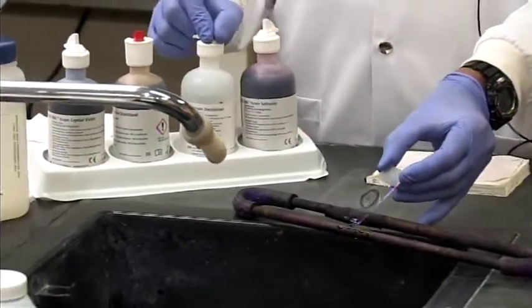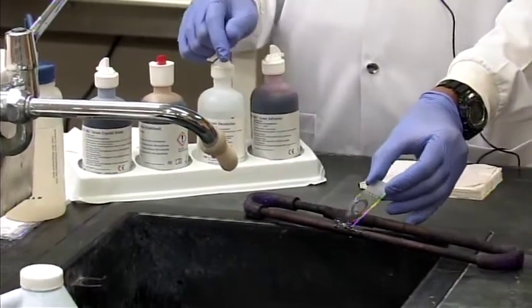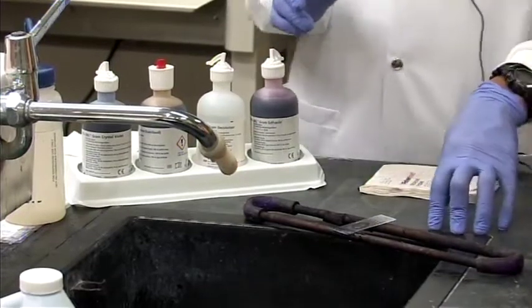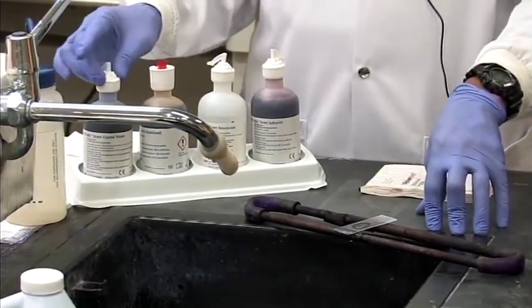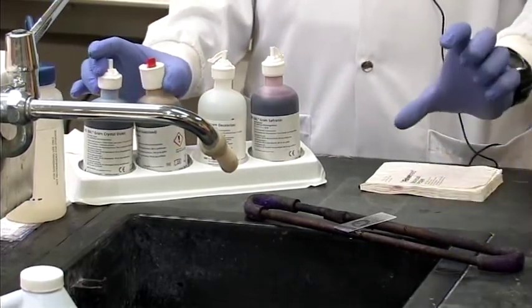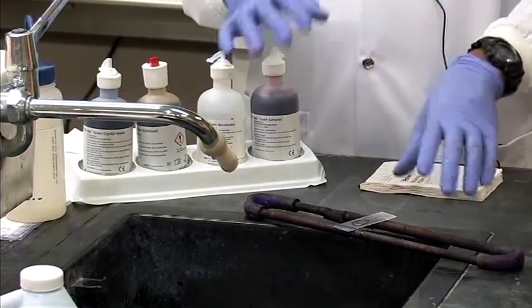We just completed the third stage, and I want you to figure out what's happening at the cellular level now. Remember, we had two types of bacteria here, gram-positive and gram-negative. The gram-positive cells would have retained their bluish-purple color of the crystal violet and iodine complex because they have a thick layer of peptidoglycan. So that complex is very tight, it cannot be easily washed off.